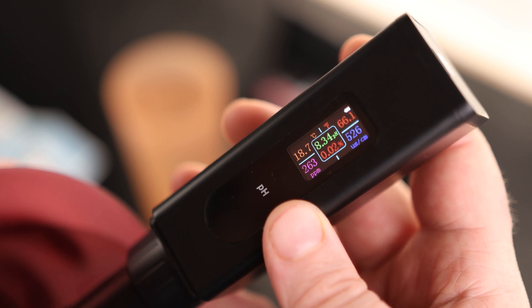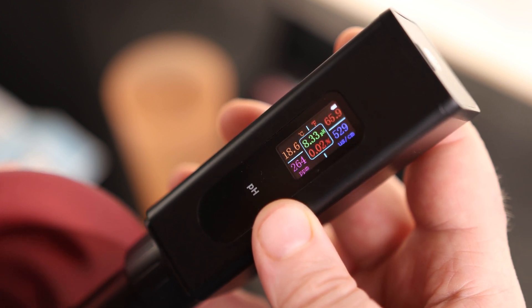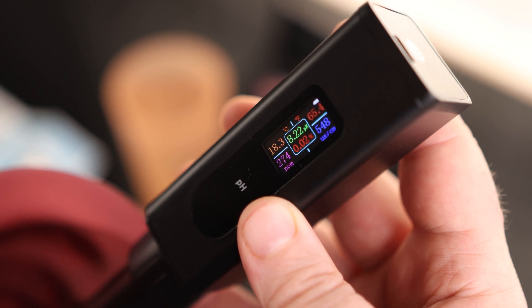So the biggest one to me is the 262 parts per million. There on the bottom left we can actually see what that is. We can also see that the pH is 8.33, the salinity is 0.02%, and we can also see the temperature in Celsius as well as Fahrenheit. That's kind of cool.